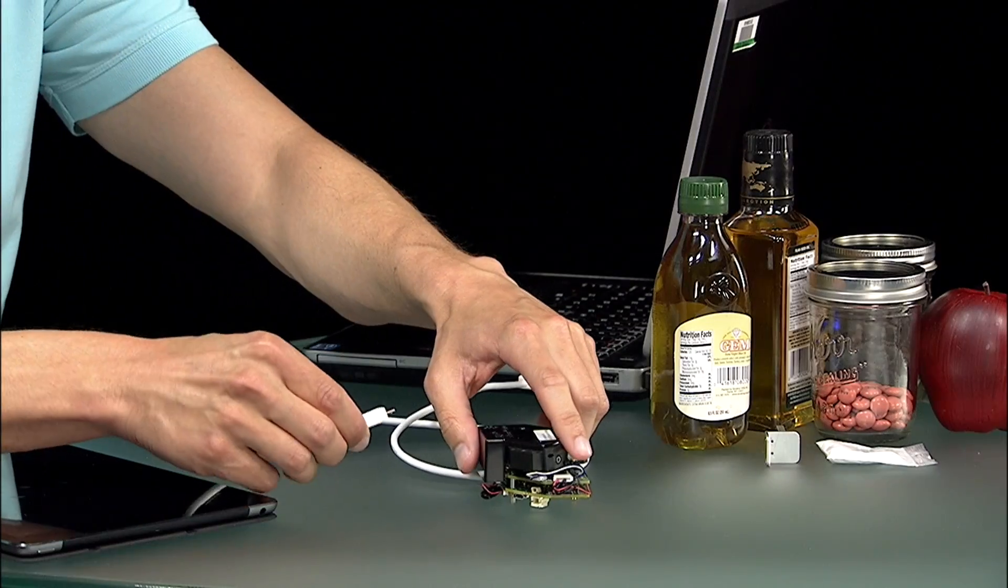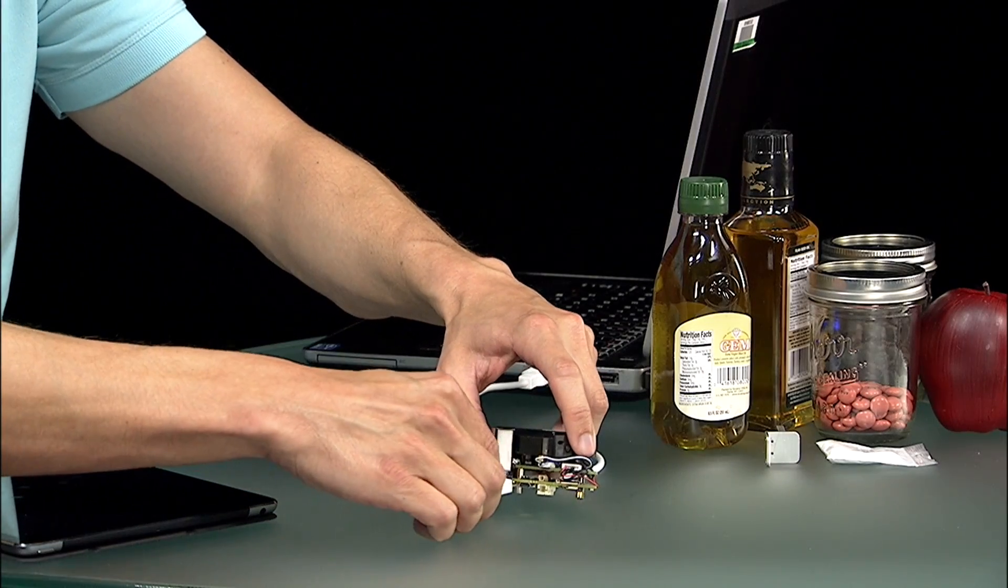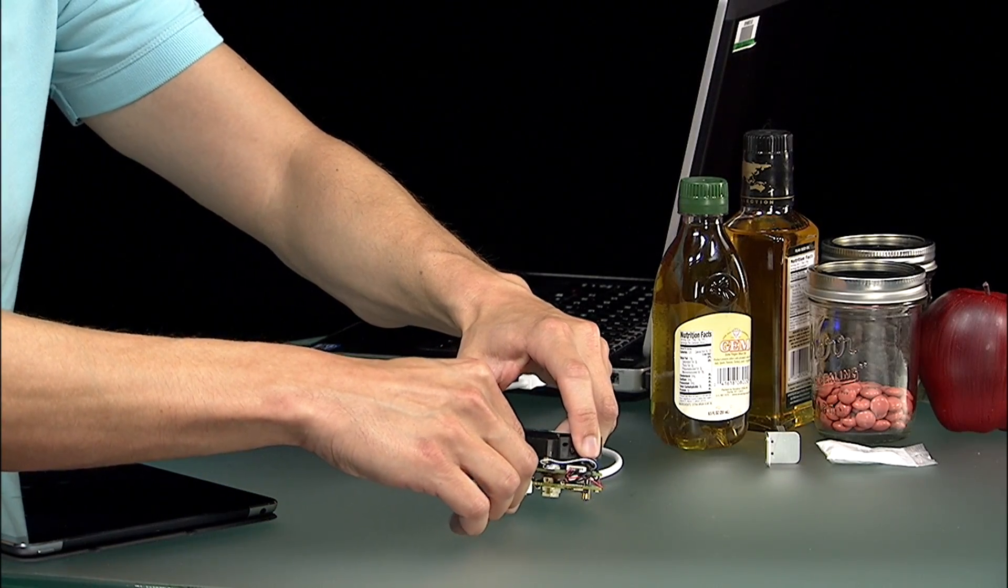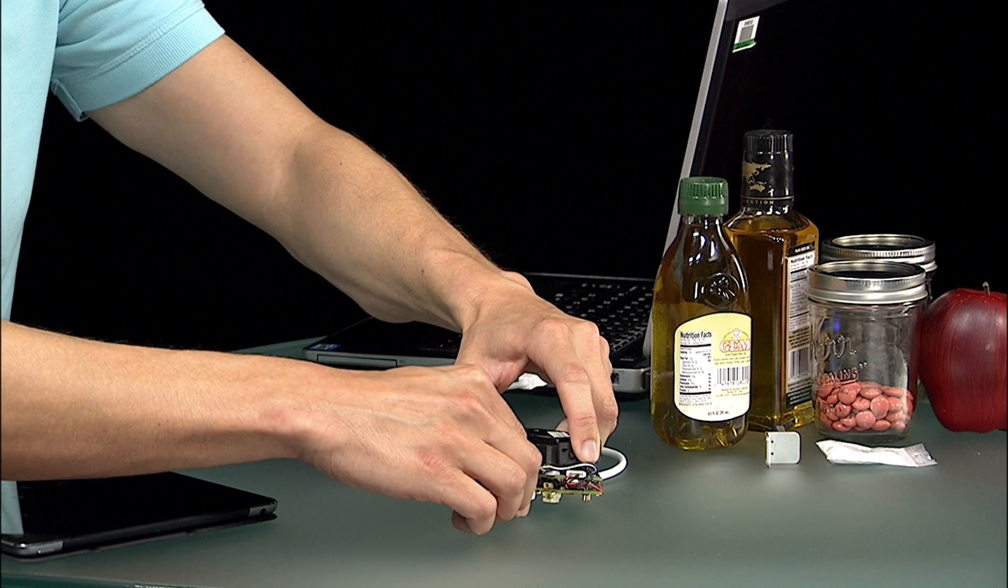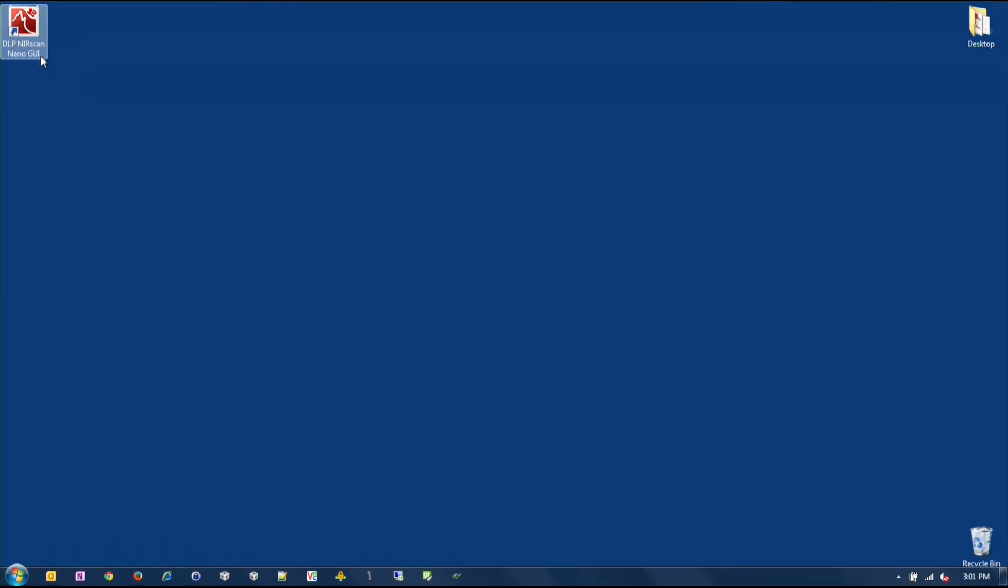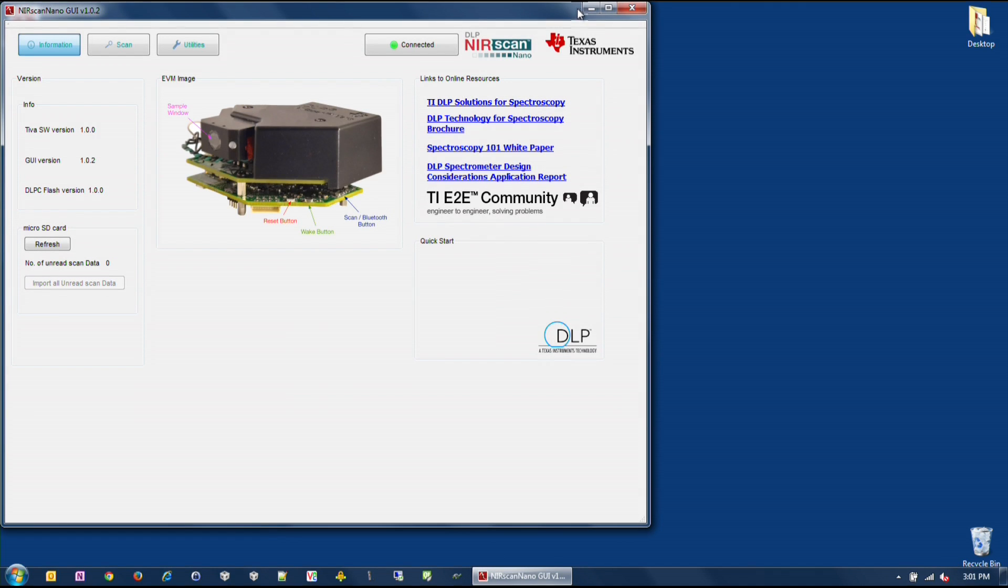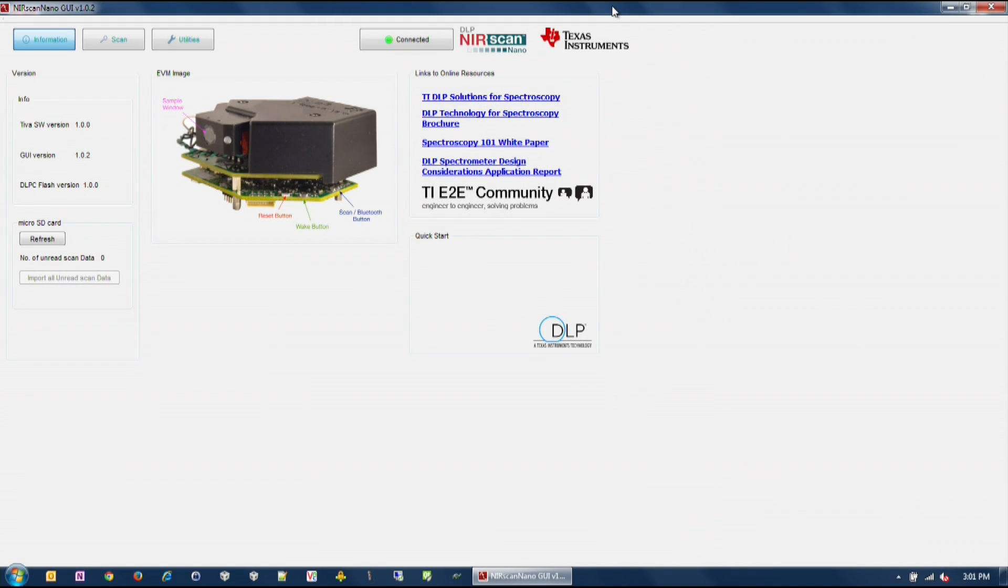For the first scan, we will use a micro USB cable. Connect the cable to the USB port on the bottom of the processor board. Upon execution of the Nearscan Nano GUI executable, the software checks for the DLP Nearscan Nano EVM to enumerate through USB and displays the information screen.